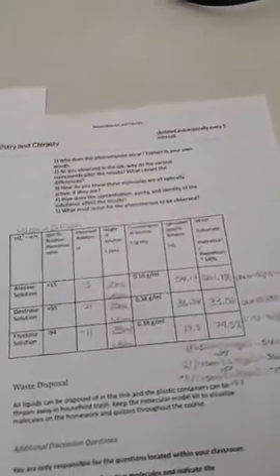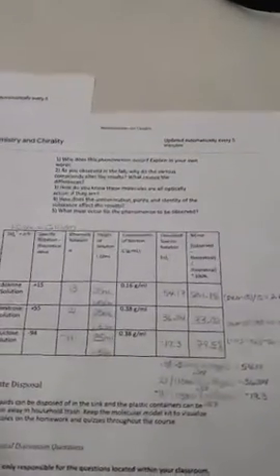The concentration, purity, and identity of the substance affect the results. If the results are a little messed up, then I can't find what the optical purity is, which means I can't find the racemic mixture or calculate the amount of the isomer. So being able to actually find a good result is what makes it to where I can actually get a purity and identity of the substances.